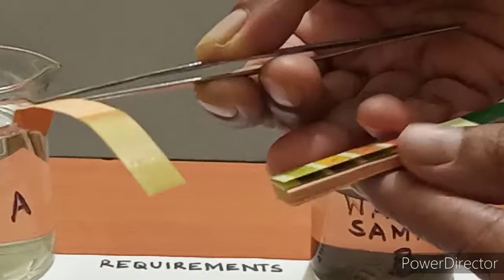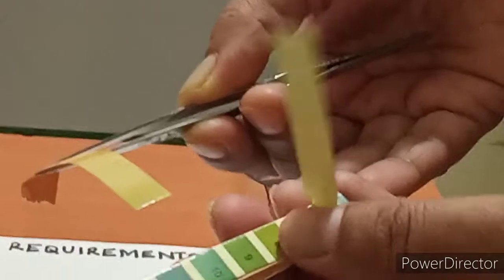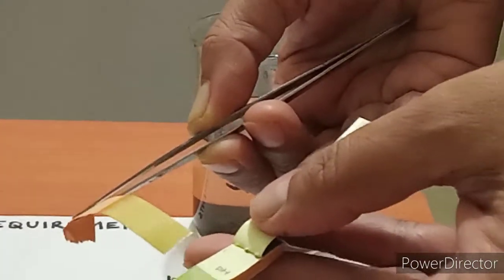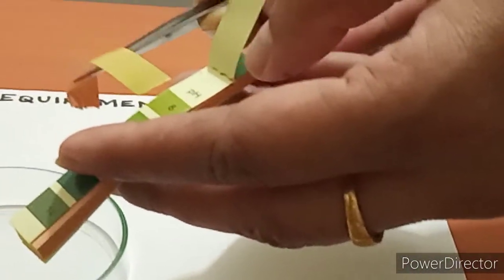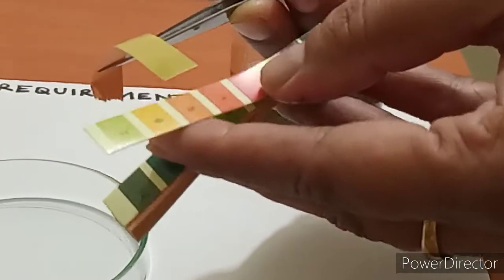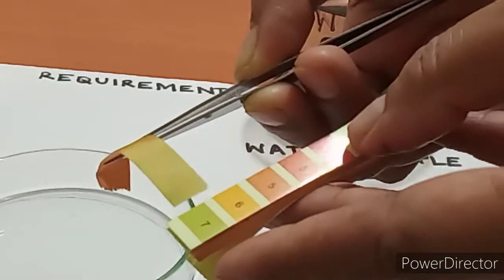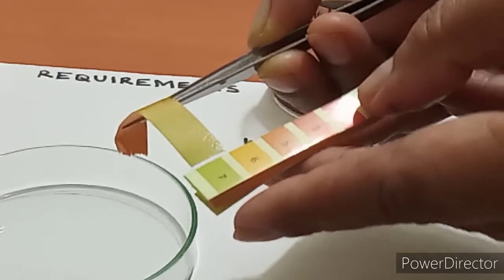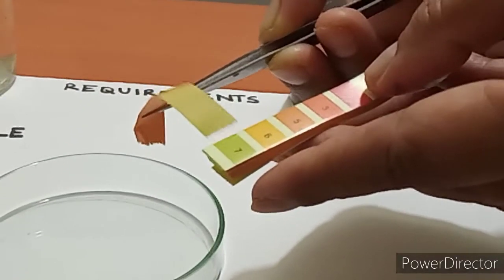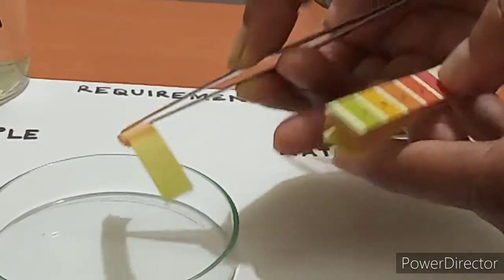Now here we have to match the color which is attained by this pH paper against the shade card. So slowly we can see that the pH of this matches with 7. So this water sample that is collected from tap water contains pH 7. So this is the correct pH of sample A.